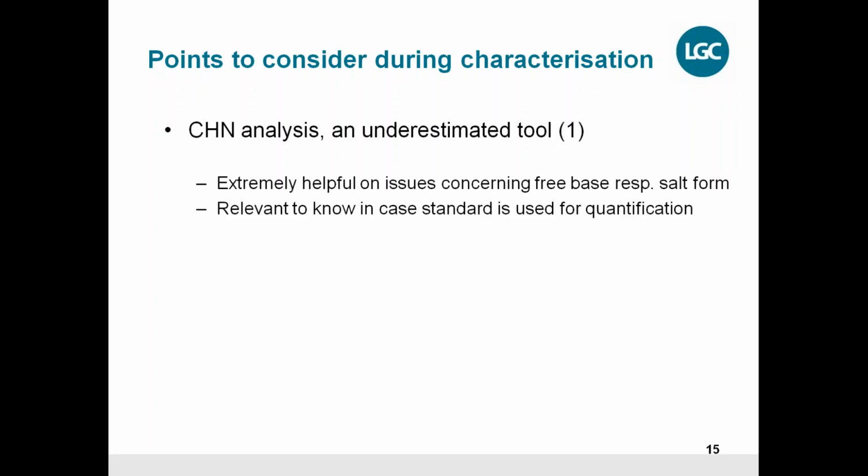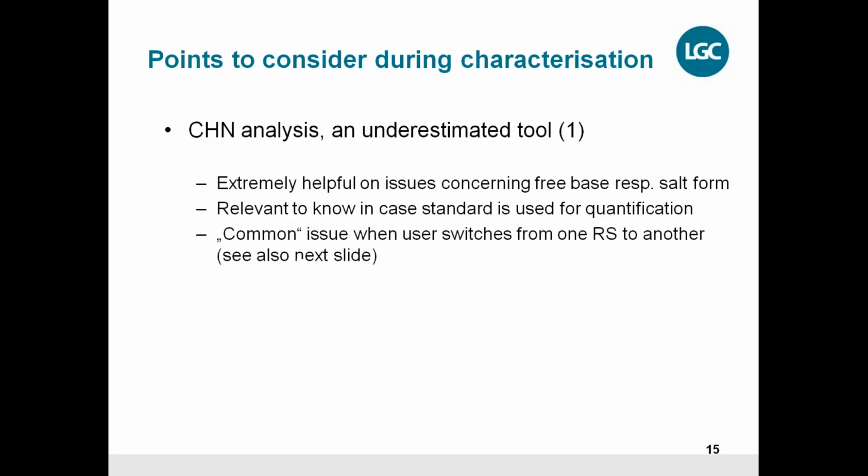This is especially relevant to know when you want to use this standard for quantification. And we have seen this very often with our customers as a common issue when they switch from one reference standard, from one supplier to another, that they then get completely different results because they switched from one form of the material, from the free base, let's say, to the salt form, or vice versa. We will also have an example there once again on the next slides.